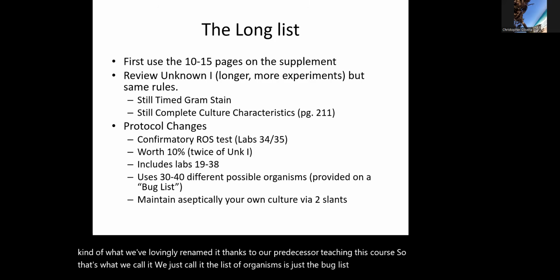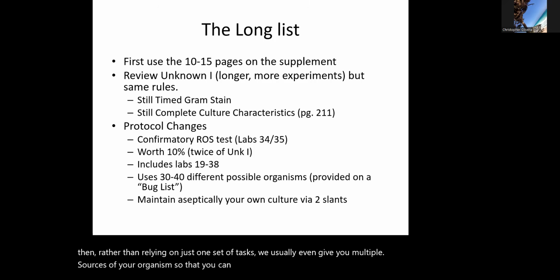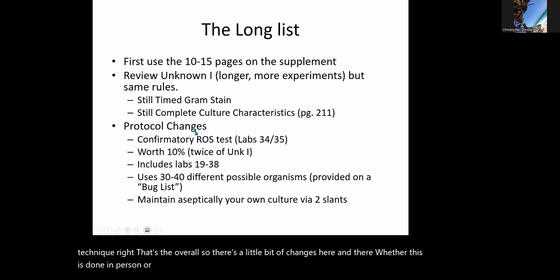And then rather than relying on just one set of tests, we usually even give you multiple sources of your organism so that you can maintain them on your own, so you can also demonstrate your ability to maintain your own culture. In other words, prove to us that you can do aseptic technique, right? That's the overall bit. So there's a little bit of changes here and there, whether this is done in person or even digitally. That's that.